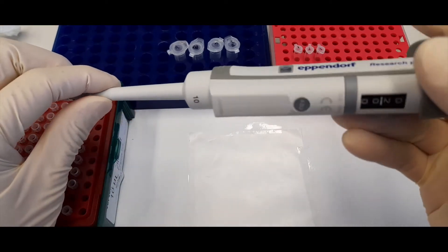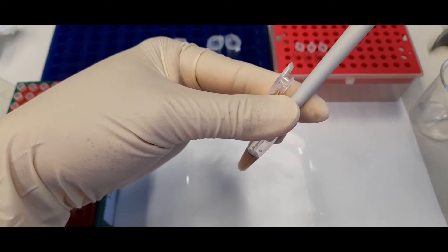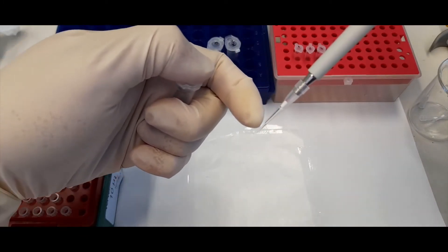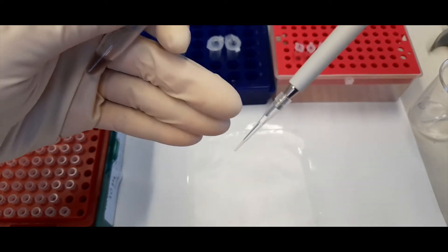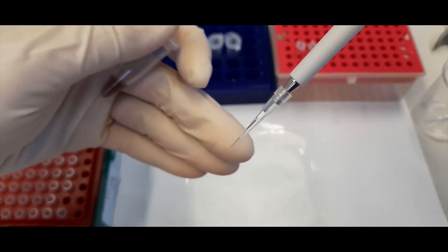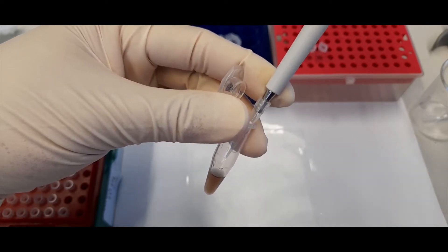So when you're pipetting a small volume — let's say this is set for two microliters — let's try this blue solution. The taking up of the solution is as per normal. Once you take it out of the solution, the first thing to watch out for is that there's not an abundance of liquid stuck to the outside of the tip. If there is a drop on the outside of the tip, that can be almost equivalent to the volume you're trying to pipet — you may end up delivering double or three times the volume. So make sure there's nothing sticking to the outside of the tip, and if there is, simply touch it to the wall of the microcentrifuge tube to get rid of it.